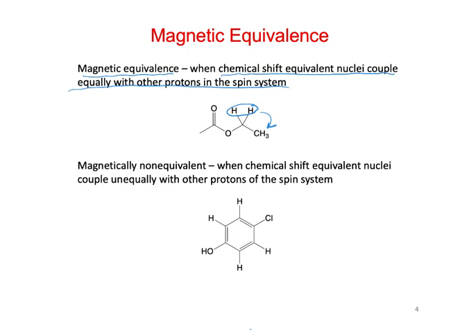And integration increases, I think, this way. Does integration increase for the methyl groups? The methyl group would have a bigger integration, right? It'd be a 2 to 3 ratio in the integration. Okay, but this is talking more about the splitting. Yeah. Okay.